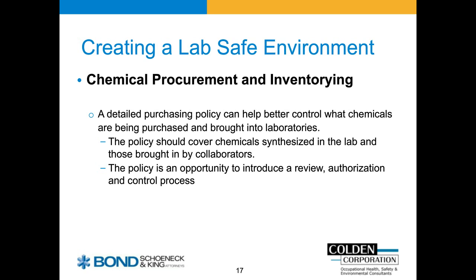Absolutely. All right. So for my last bullet, chemical management as a nugget. This applies to the chemistry labs primarily, but also the biology labs. We tend to kind of look over them, but maybe not as much chemical use as chemistry labs, but some serious hazards there as well. And this is where Barry and I tend to talk the most and shake our heads and go, wow, this is the Wild West sometimes. I have encouraged and pushed and thumped my drum for two things for chemical management with my clients. Do you have a good chemical procurement policy?